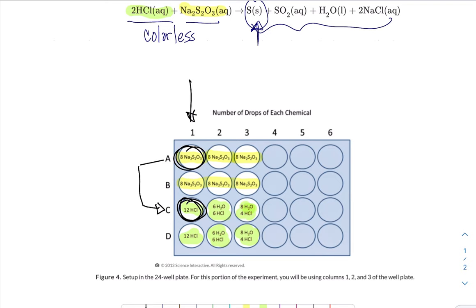You're looking at it from the top over the dark X, and as soon as the X is obscured, you're hitting the timer on your stopwatch and you're recording the number of seconds that that reaction took.